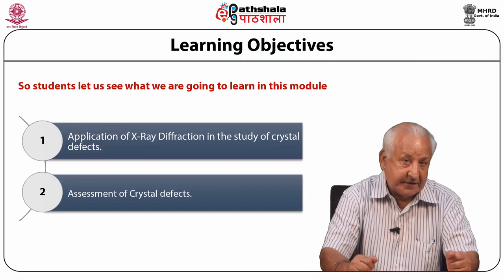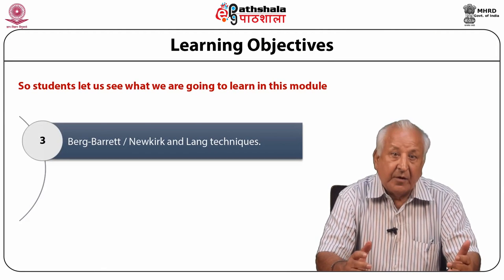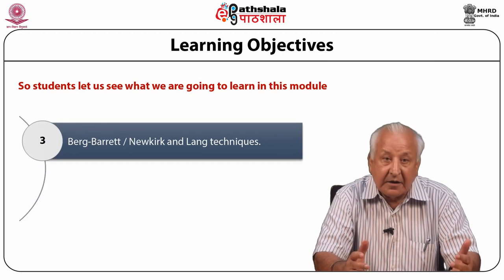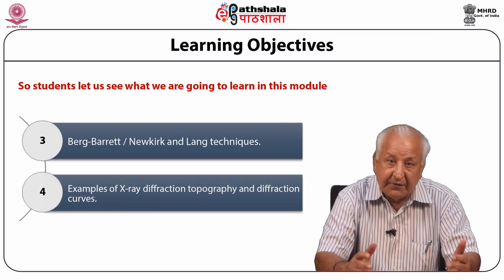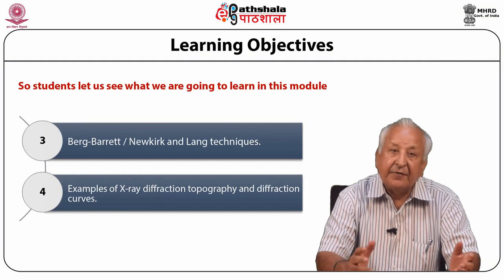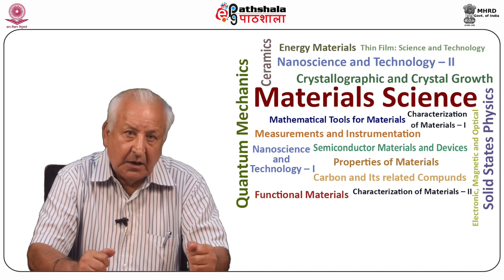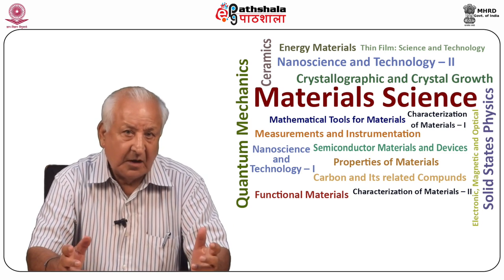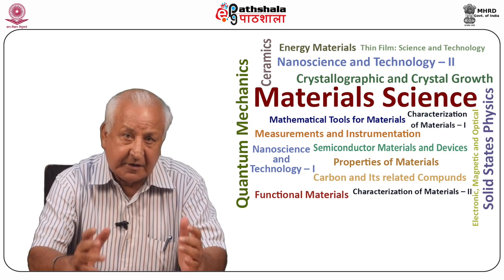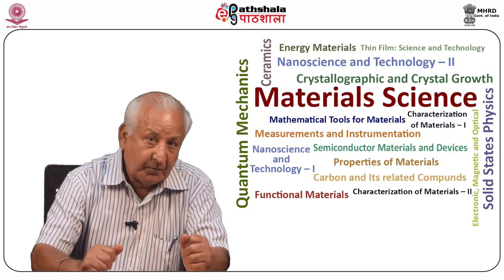assessment of crystal defects, the Berg-Barrett, also known as Newkirk, and Lang techniques, and examples of X-ray diffraction topography and diffraction curves. Assessment of crystal defects. The experimental techniques of X-ray diffraction for assessment of crystal defects can be explained as follows.